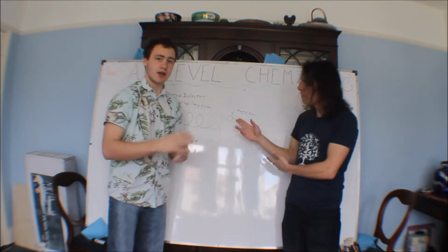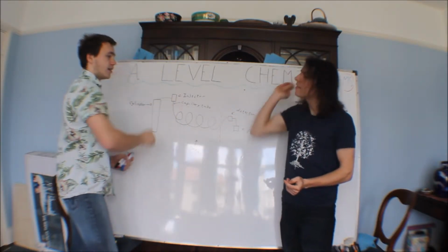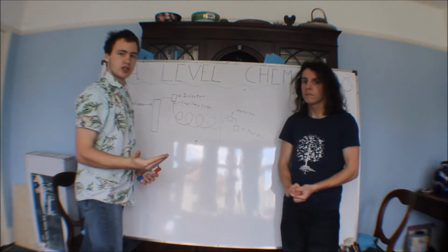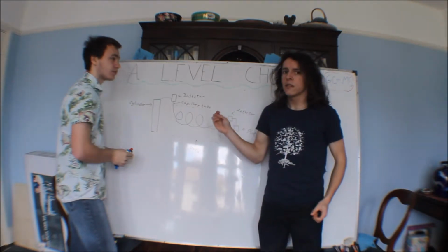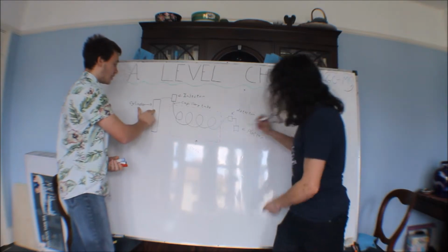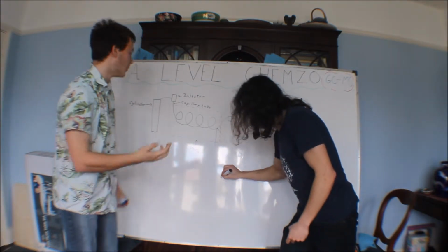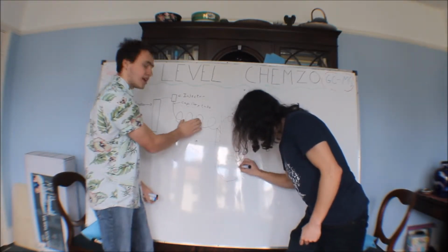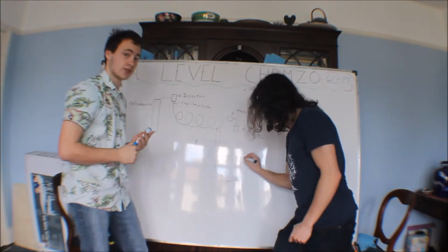So, take my perfume, put it in. It's then going to drip into an oven, and the oven's going to be at a heat where it will turn it into a gas very quickly. So as it vaporizes, it will go through our tubes. But let's zoom in on the tubes. The mobile phase, the thing that's in the cylinder, let's say it's helium, is used to push it round the loop so it doesn't just stay in there as a gas. It gets pushed through and out the other side. So that's what that's for.